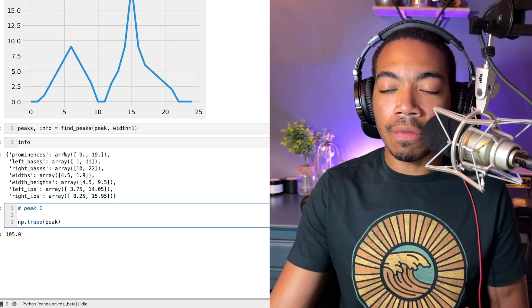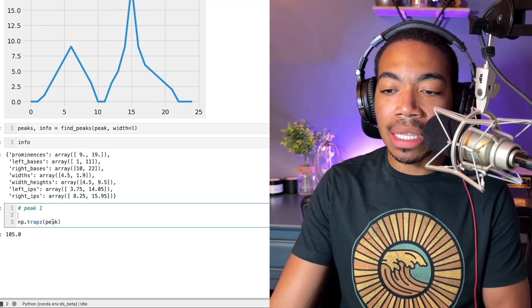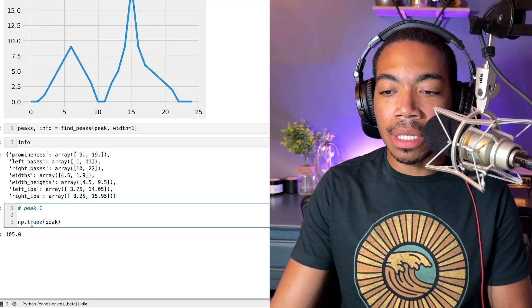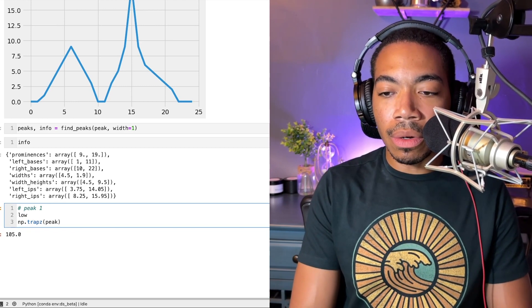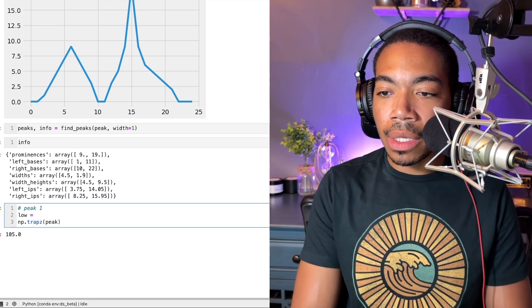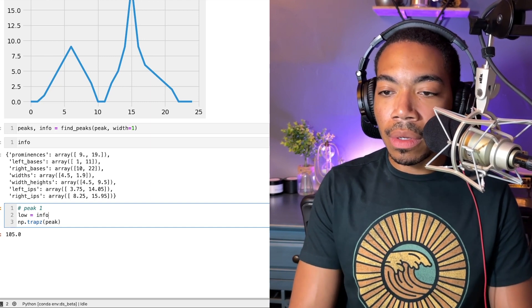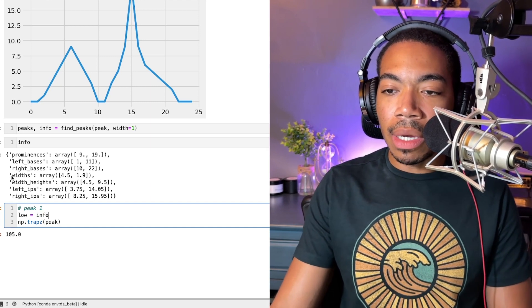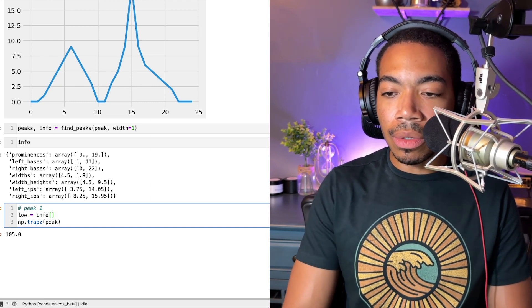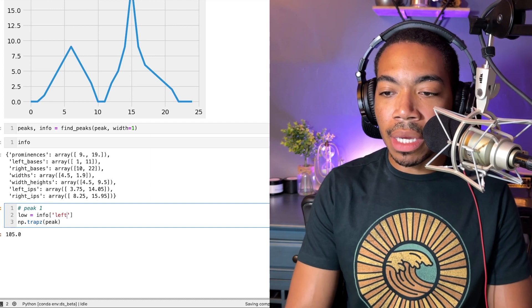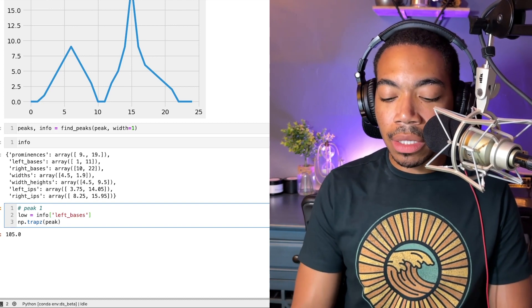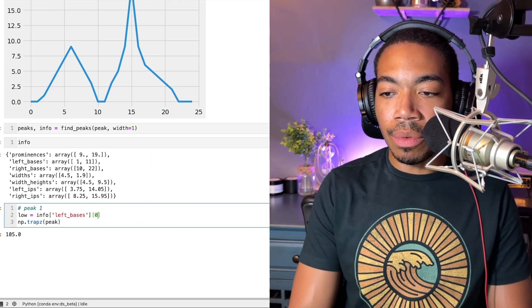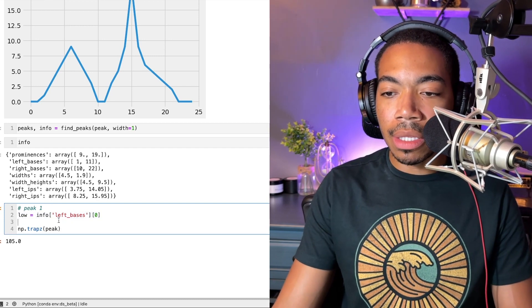Let's write some code to specify where that's located and then pass that to trapz. Let's define where the low range is. We'll set low equal to info—and info again is this dictionary—we're going to look at left base, and then from left base we want the first value, which will be zero.